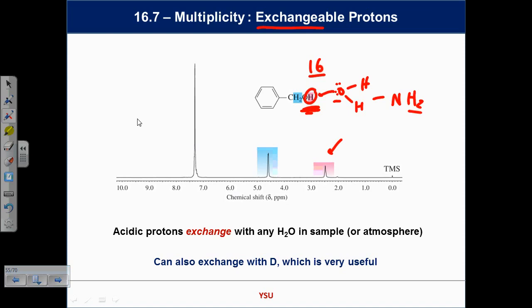Somewhere in between, maybe you take the spectrum here, and maybe you'll see a broad signal. So I want to draw your attention to this idea of a broad signal, BR. If you see a broad signal, typically it's an OH group or it's an NH group. And this answers the question, why on that chart is it such a broad range? The alcohol signals tend to be something like 2 to 6 or something like that. They're very, very unpredictable in terms of where they show. And it's all because of this exchange idea. They're not sat exactly on the same atom all the time.